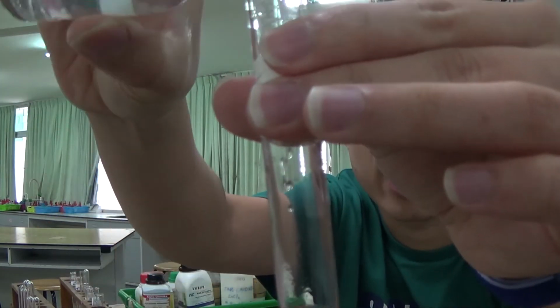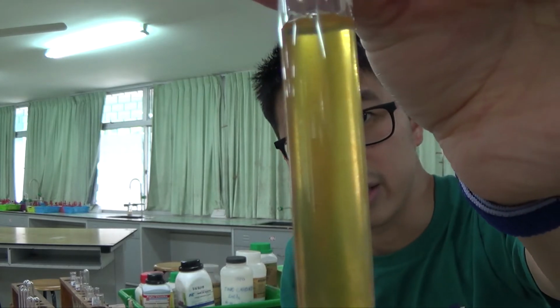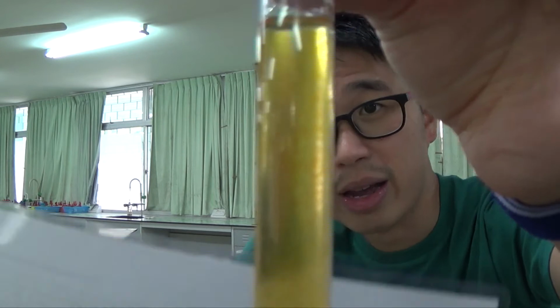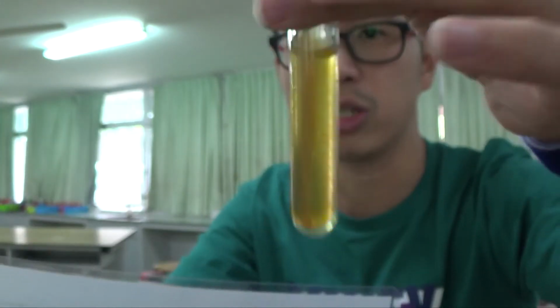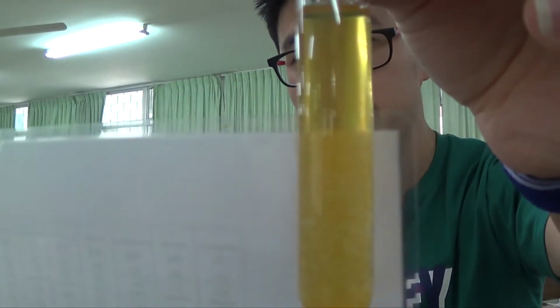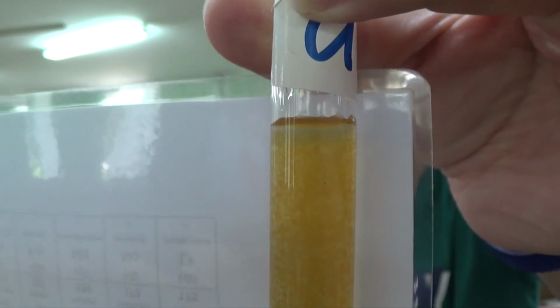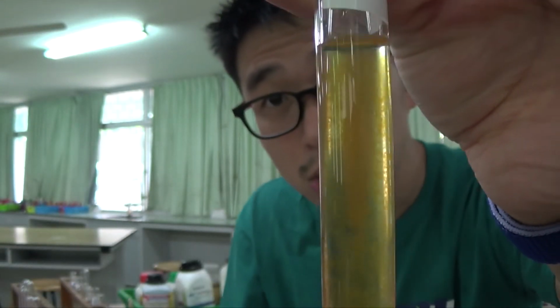I should try and add excess ammonia. It looks like it dissolved, but look very carefully. Not too sure if it is clear or not. There's like suspension again. So it looks like most of it dissolved, right? But if you look carefully, there's a suspension that doesn't want to go away. The precipitate is very fine. It is still suspended within the solution. So it looks clear, but you see the solid being suspended.